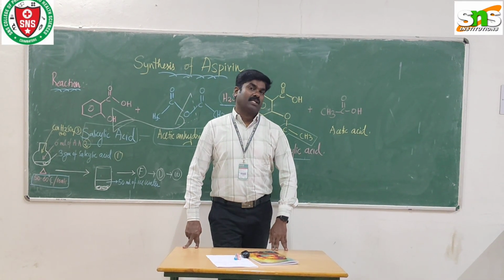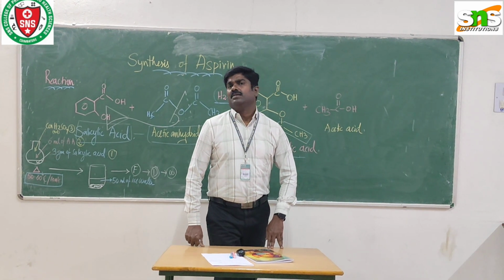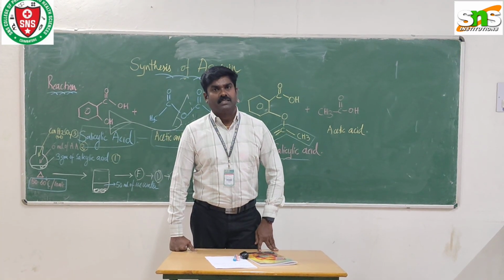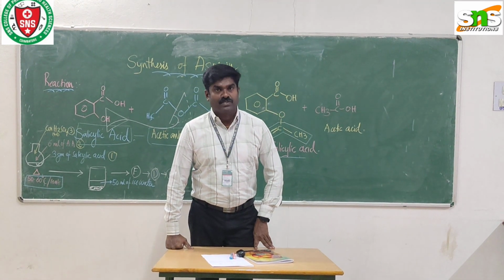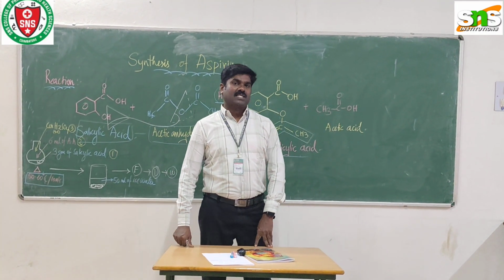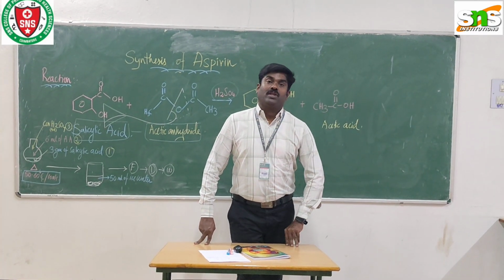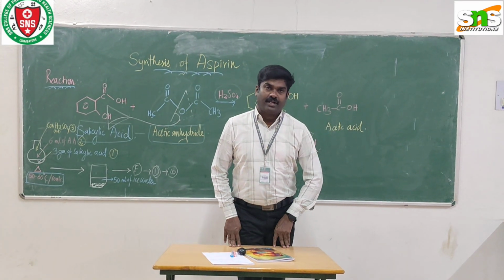This acetylsalicylic acid is used as an anti-inflammatory agent and antipyretic, and another use is that it can be used as an anticoagulant also. You know, aspirin is a white powder, and with the help of suitable qualitative analysis we can identify it.